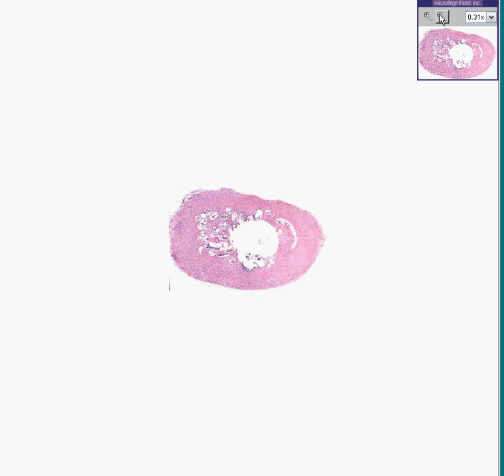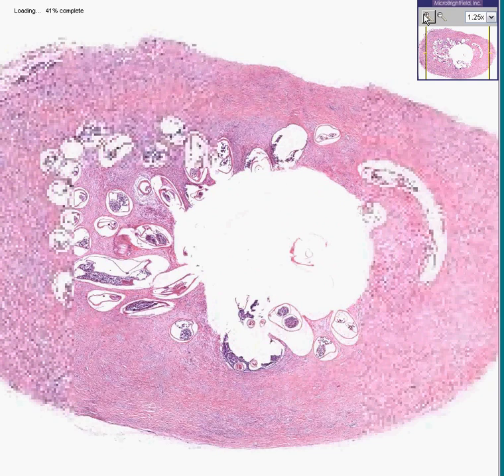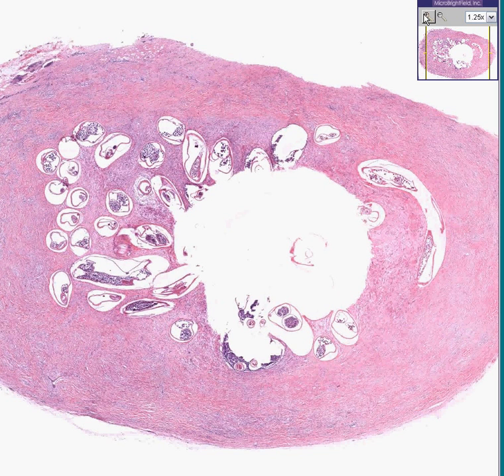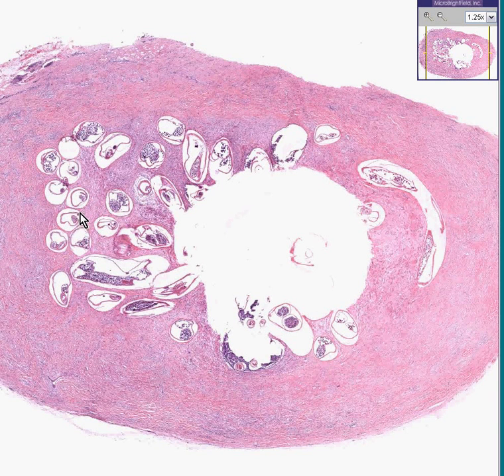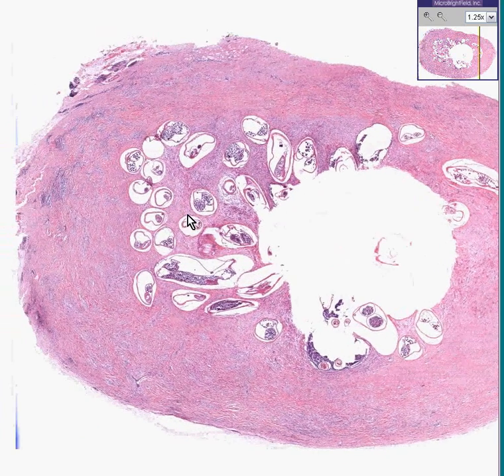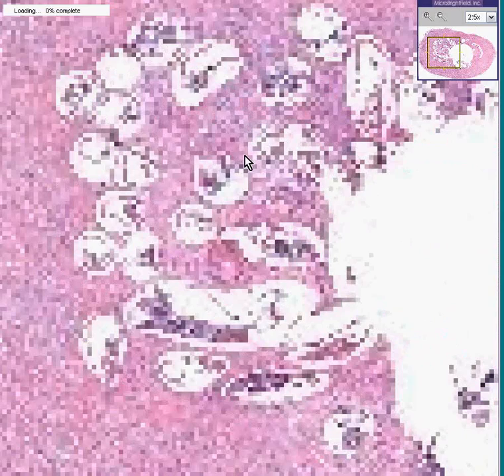This particular worm is called Onchocerca volvulus. It causes a disease called river blindness because that's where you pick up the organism — around a river. It's predominantly in Africa and it's the second most common cause of blindness worldwide.